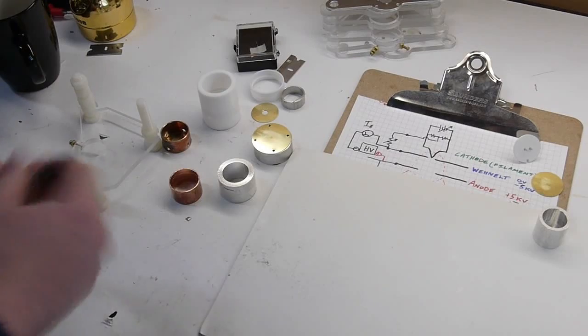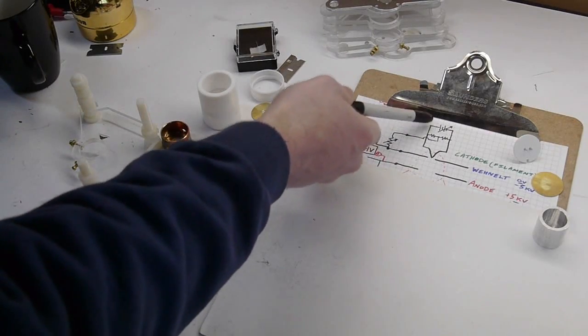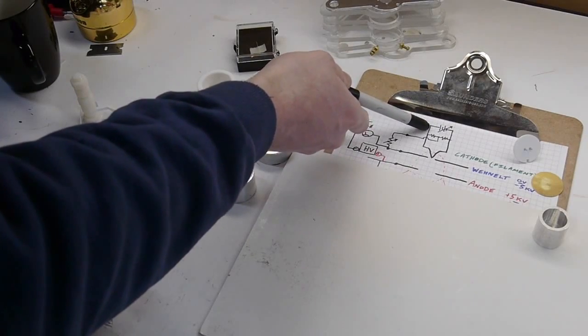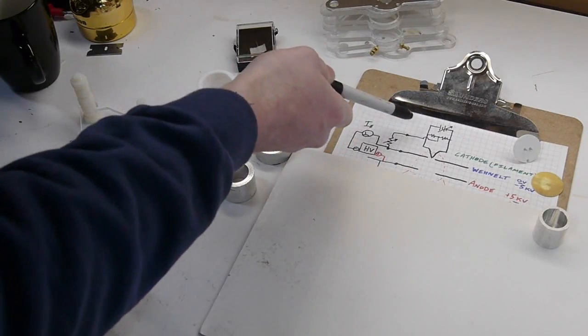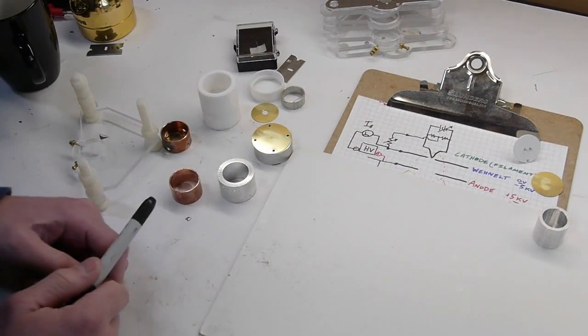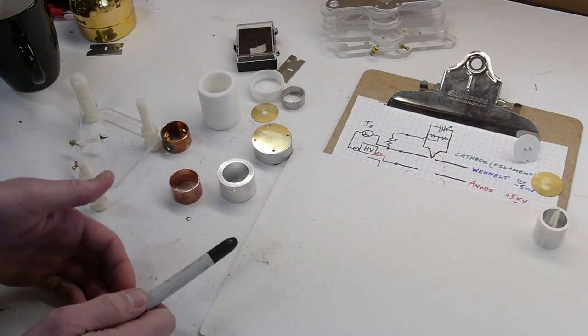So the filament is heated up by a DC power supply, which I'm representing with a battery with an arrow through it. There's nothing special about heating up a filament with DC power. It's just convenient. If there were some other magic way to make the filament hot, that would work too.